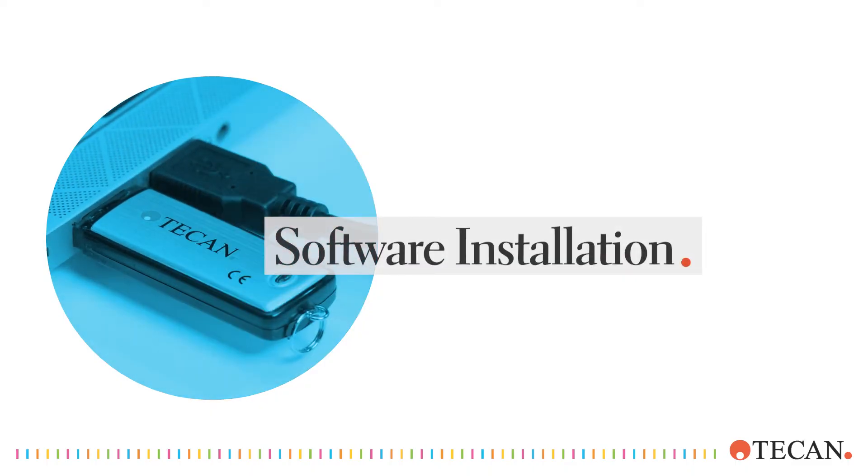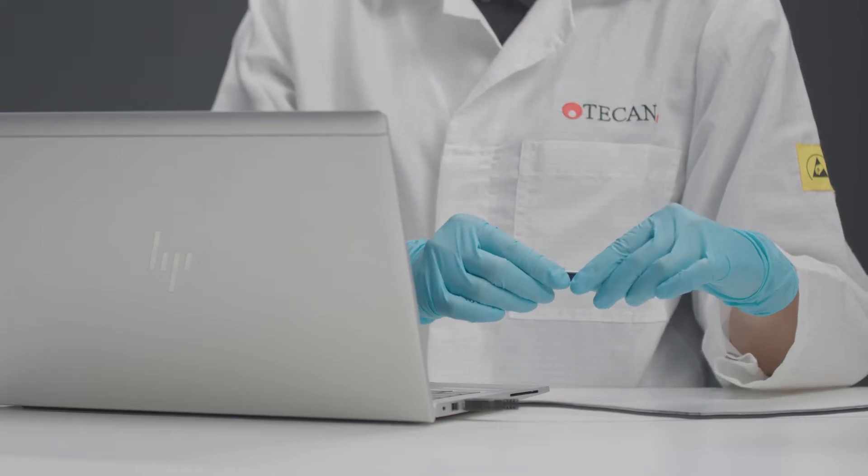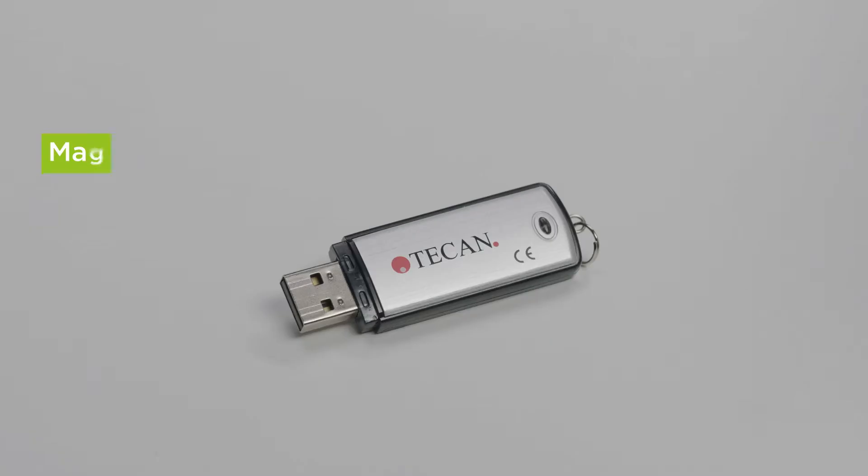Now we're going to show you how to install and register the Magellan Tracker version. The Magellan software is available in two different versions, Magellan Standard and Magellan Tracker.